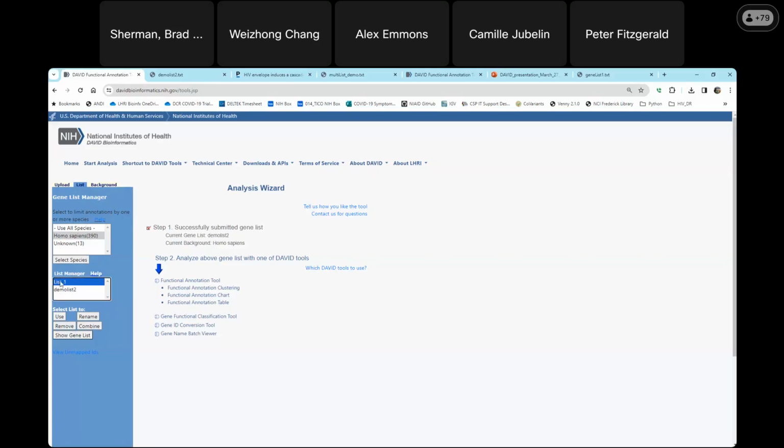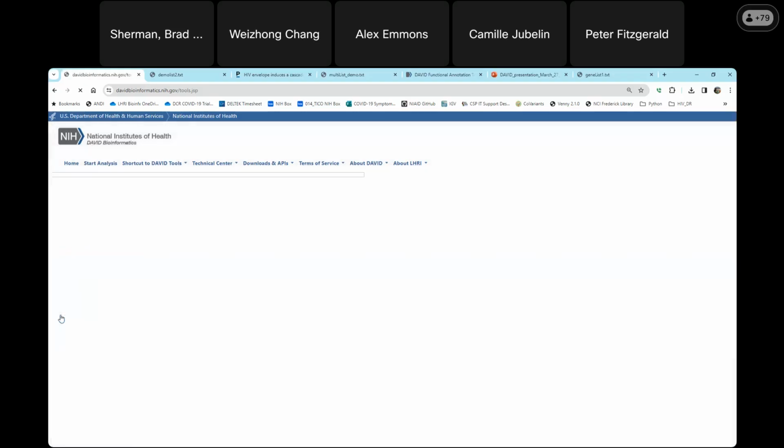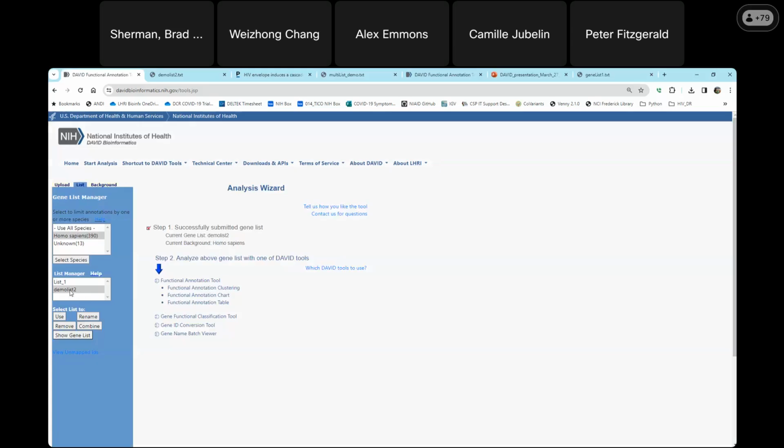I can see here that initial list that I uploaded, and then my demo list, which is now the current list because I just uploaded it. But if I wanted to switch between them, I could do that by highlighting and selecting use. Okay. So now that my list is uploaded, the analysis wizard shows me a little information about what's going on.